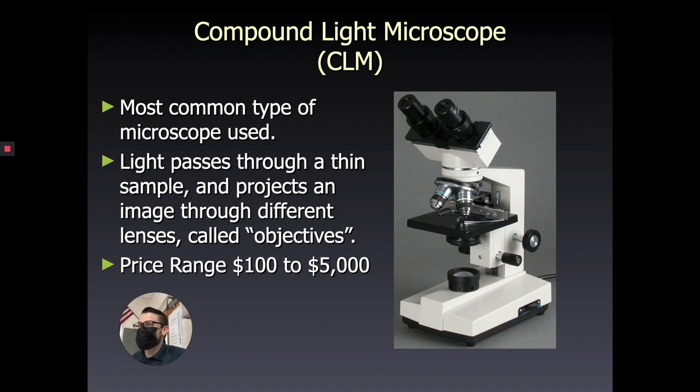I've done this for middle school classrooms where I've had groups of squirrely 8th graders and I've taught them how to properly use a compound light microscope. So it's relatively simple and relatively readily available to the general public. So these are very, very common microscopes. And we're going to go over the parts of the microscope and how it works in more detail when we actually work on a lab using these microscopes.